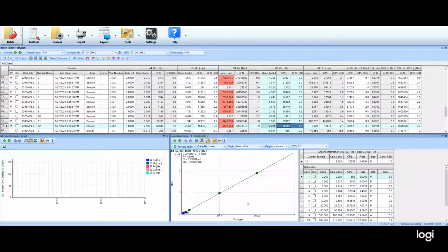The other two items on the screen, I just quickly want to talk about the calibration that we have down here. The calibration, of course, is what it is. We look at the quality of our calibration curve. There are blue points right here. The blue points correspond to in what mode the detector measured. This is called pulse, while green is analog. A pink measurement is when it switches from pulse to analog, which is just a measure of if too many counts per second come into the detector, then it switches modes to a less sensitive mode.